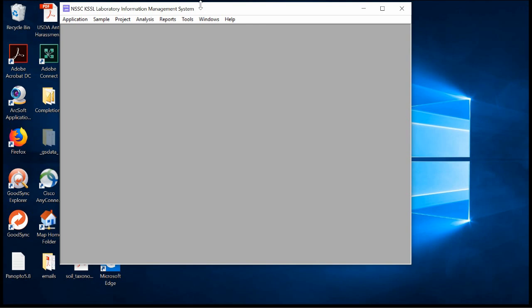As Steve said, if there's any problems with using it, you get windows popping up that say there are errors, then I want you to either take a screen capture of that and email to me, or you can use Skype and talk with me about what's going on, and we'll try to get your problems rectified as soon as possible. I'm going to turn the meeting back over to Scarlett, and then she can continue talking about what parts of this LIMS you're going to be using.